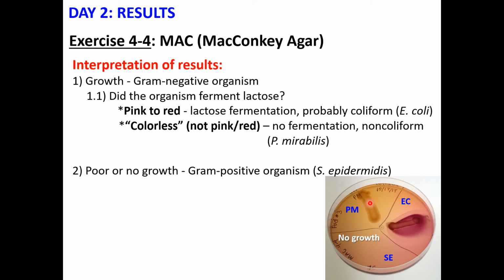Now for P. mirabilis, there'll be no fermentation whatsoever. So basically the color of the growth wouldn't be different from the background. If you look at your lab manual, it may say colorless, and that's not exactly true, because there's no color. It's just not pink or red anymore, so that's how we call it colorless. That means there's no fermentation, and it means that it's not a coliform.